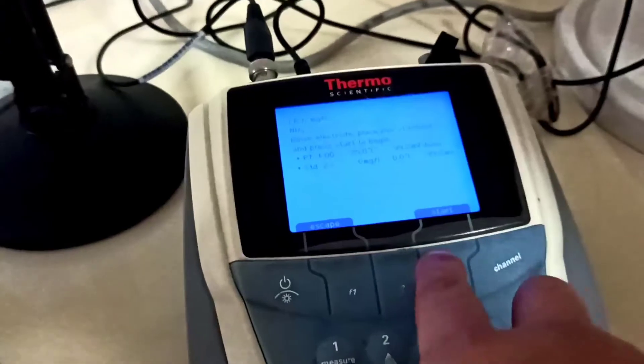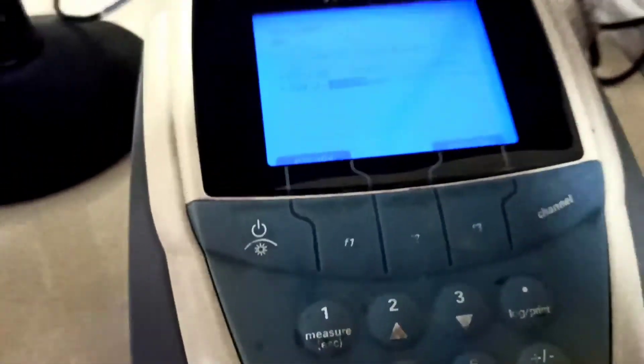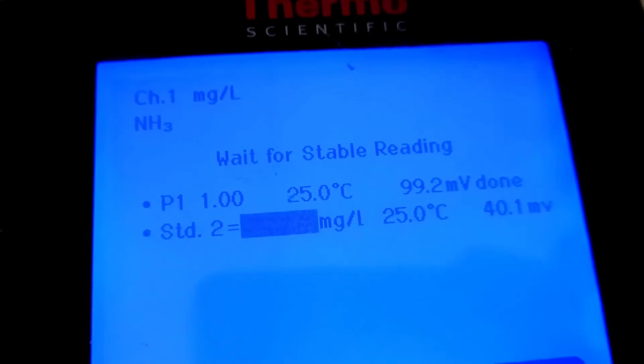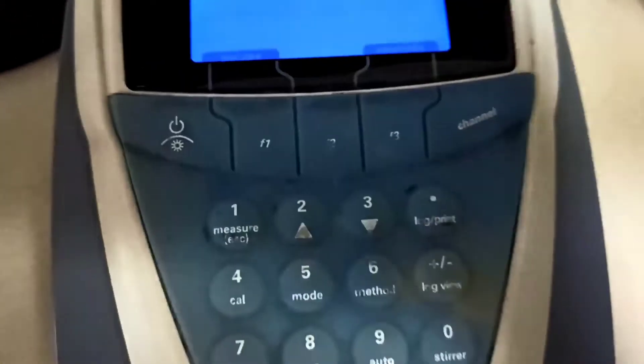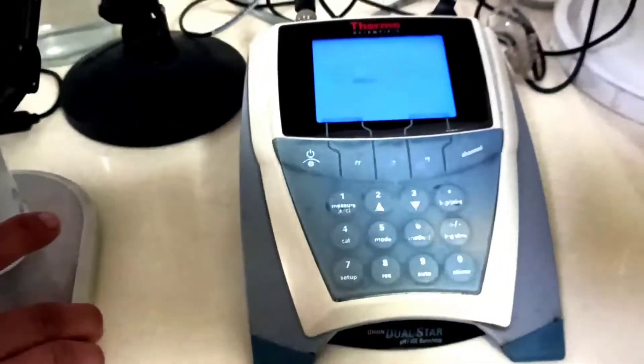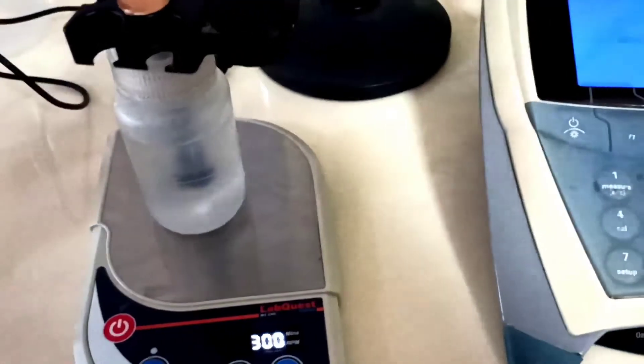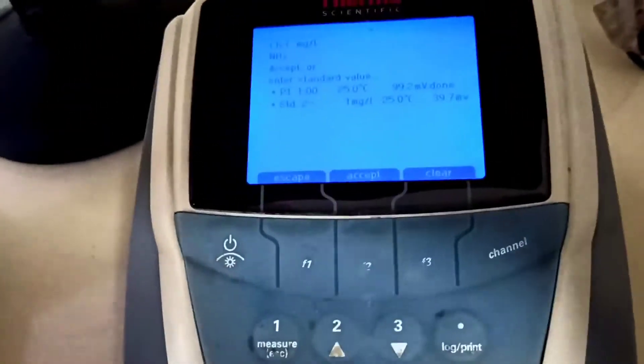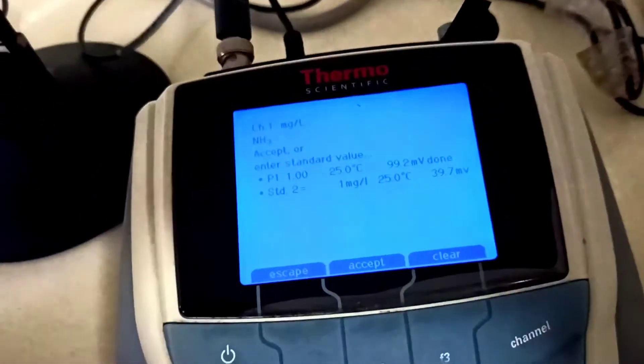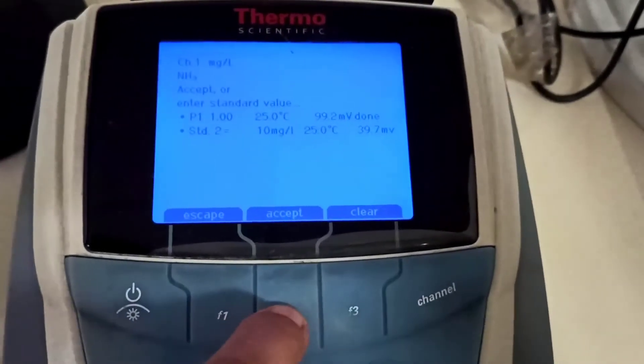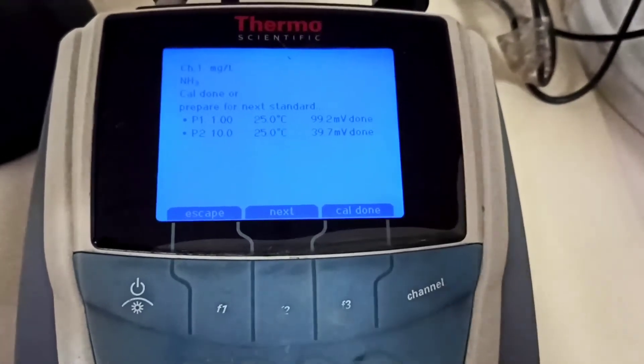Let's see how much we get. It takes too much time. We calibrate 10 ppm and we get 17.3. It's under process. Stirring plays a very important role because the pH maintains at 11 and liberates a huge amount of ammonia.